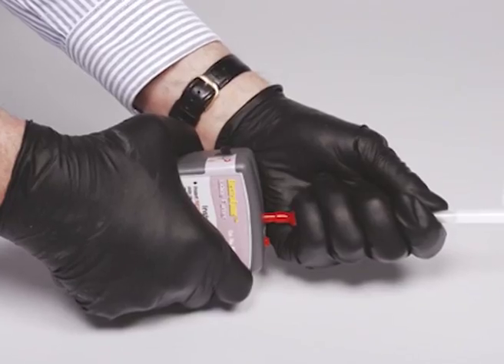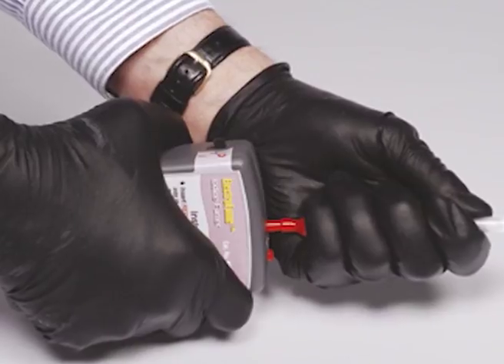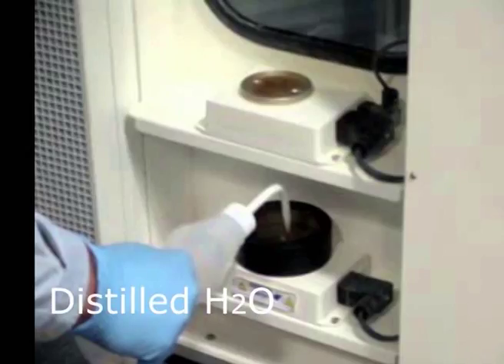The next method in iodine fuming is the fuming cabinet method. A china dish containing about 1 gram of iodine crystals is placed in a fuming cabinet. The object bearing the latent prints is suspended from the roof of the cabinet. Iodine crystals are gently heated to about 50 degrees centigrade using a heating block.